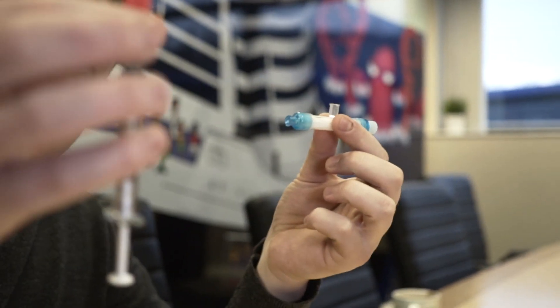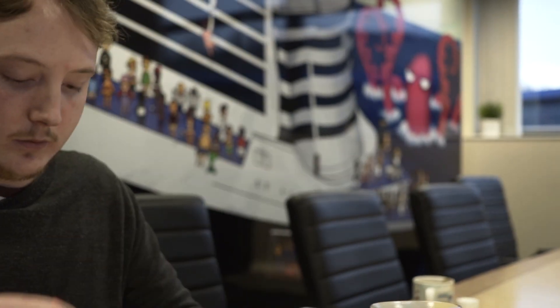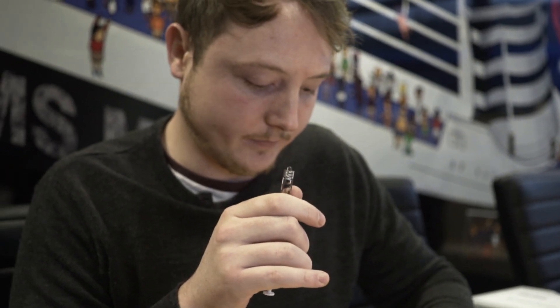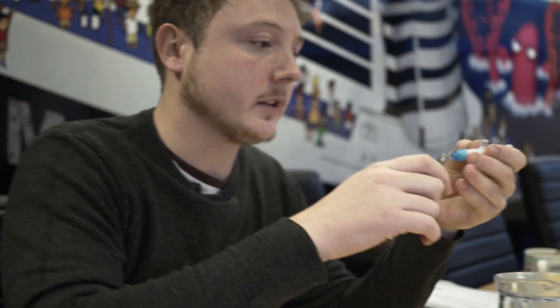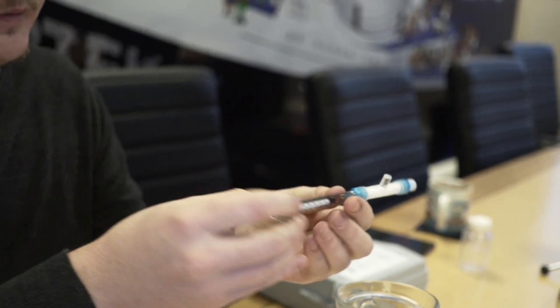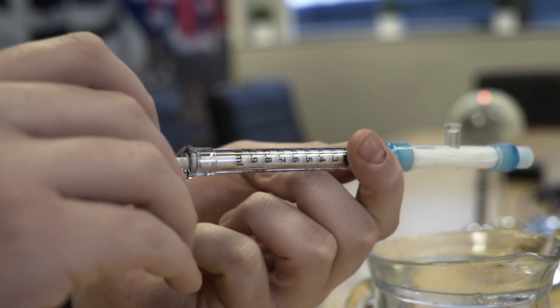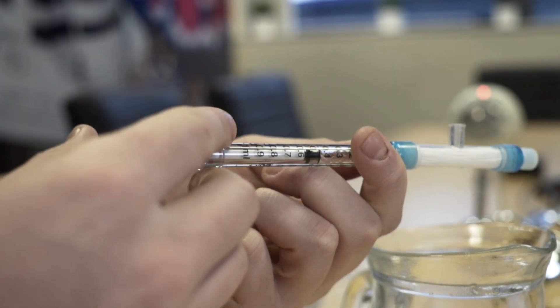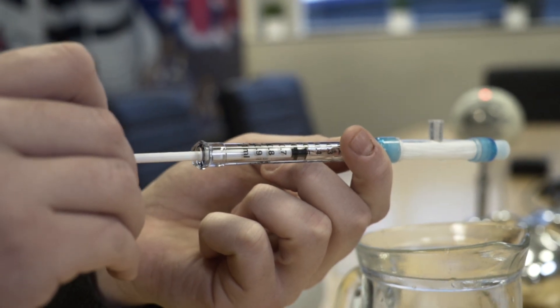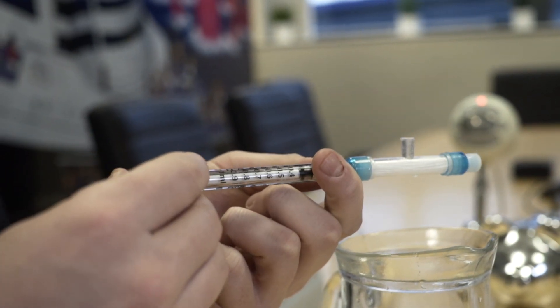Now we're going to take this second syringe, remove the red cap, and attach it to the open end. What we're then going to do is draw it back to the 0.5 ml point, then push it back through into the filter. We're going to repeat that process another three times.